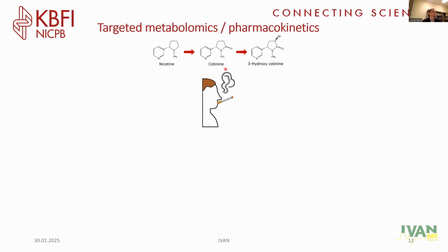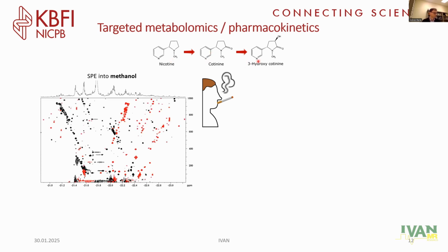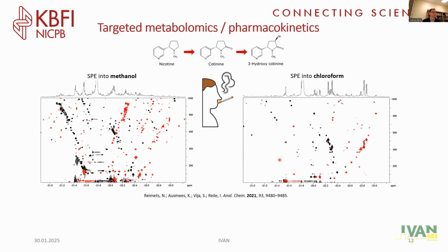So we reasoned that nicotine can bind to iridium. Nicotine consumption and metabolism is very, very well known. We played around with different sample prep methods and devised one that gives a reasonably pure sample with nicotine and its metabolites easily visible here.